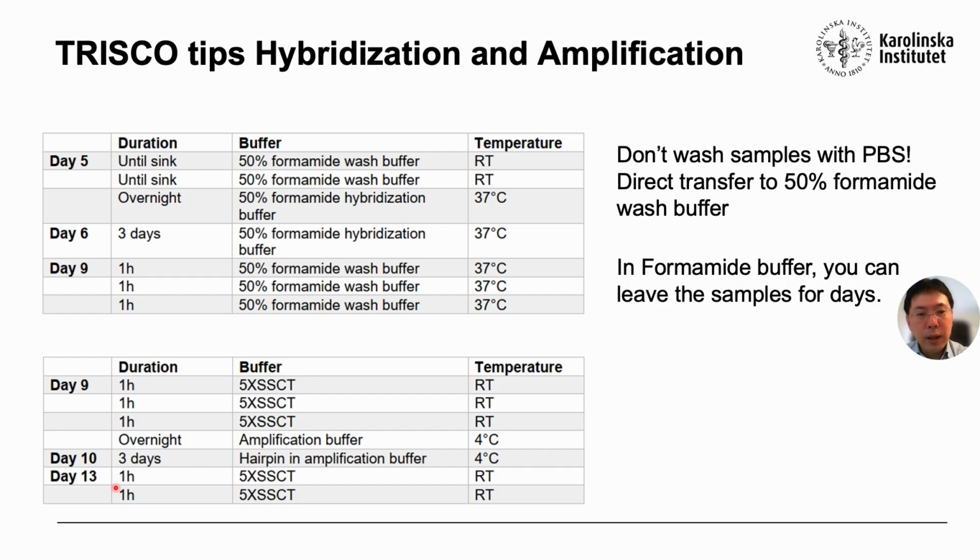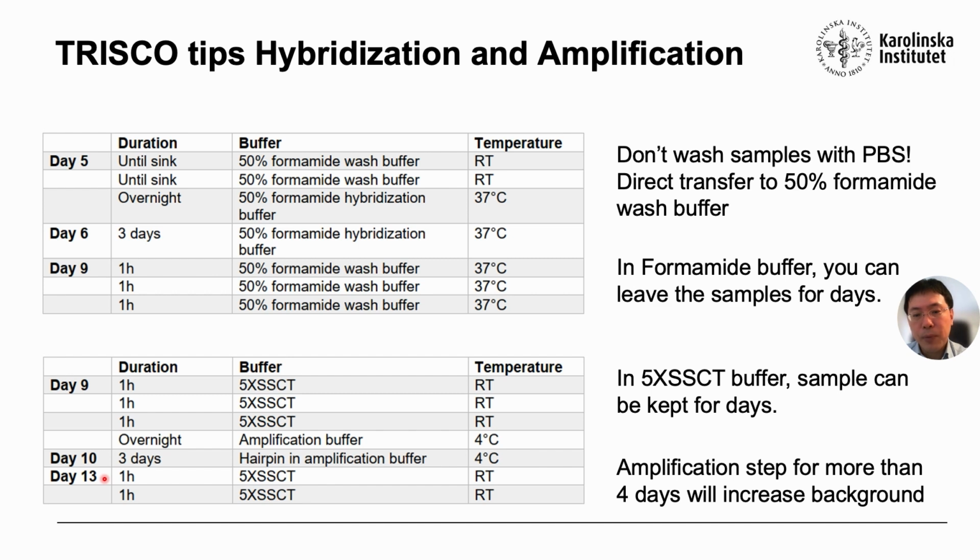On day 13, we wash the sample in 5x SSCT. If needed, the sample can stay in this buffer for a few days. Just keep in mind that the amplification should ideally be completed within 4 days to minimize background.